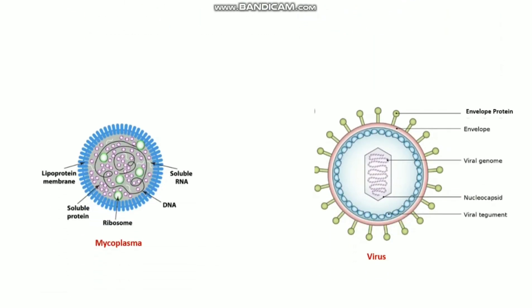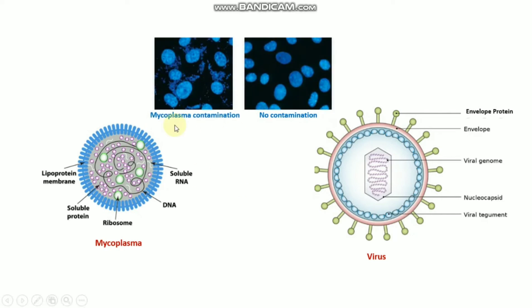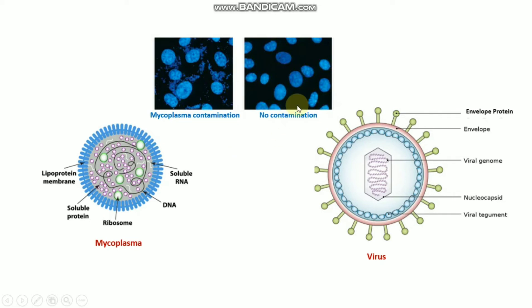DAPI is also popular for labeling cell cultures to detect DNA of contaminating mycoplasma or virus. As you can see in this picture, this is mycoplasma contamination, so the mycoplasma DNA is stained with DAPI. Here, there is no contamination and no background noise — you can compare these two pictures: no contamination versus mycoplasma contamination.